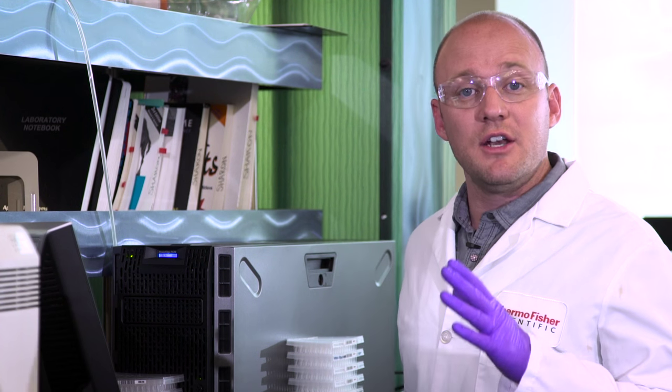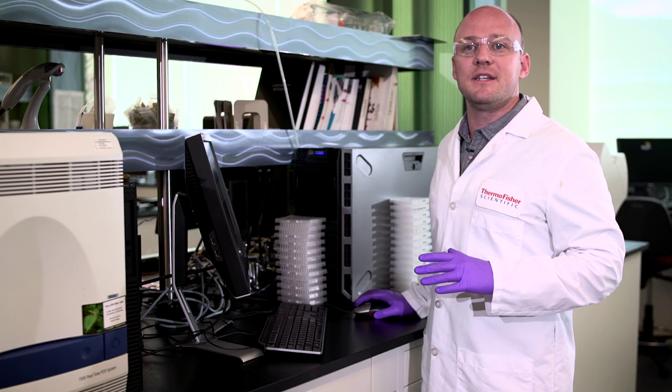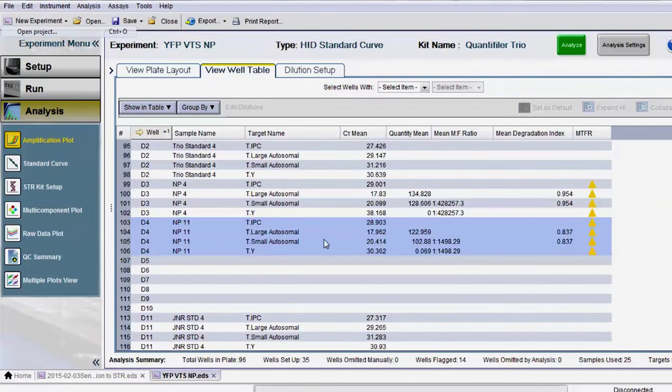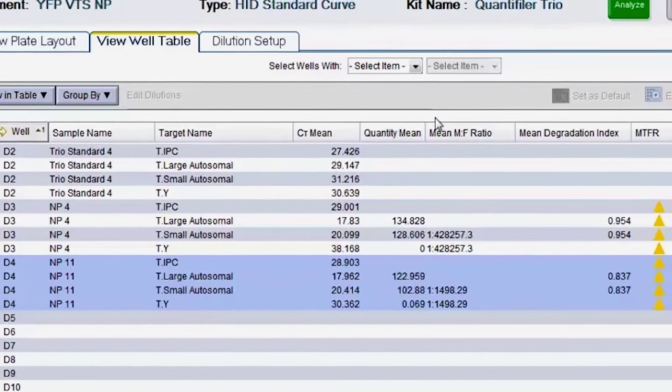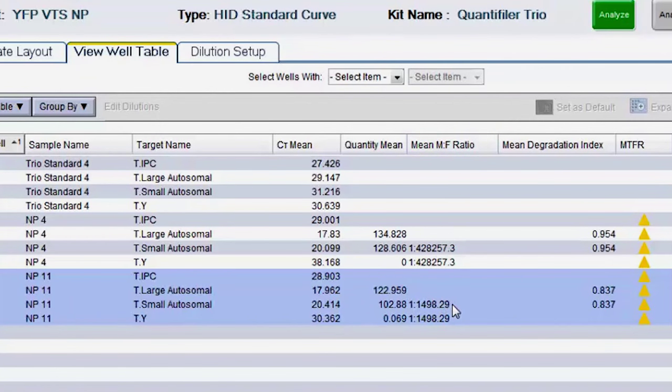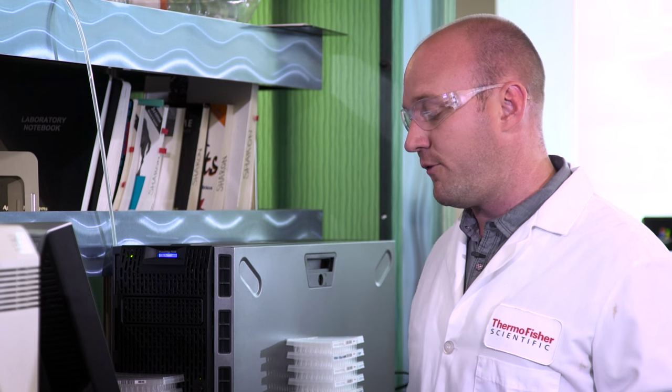Now, let's consider another sample. In this case, we have a vaginal swab that was taken two and a half days post-coital. For this sample, the presence of male DNA was confirmed by the Quantifiler Trio Kit. Our quant result, as you see here, focusing on sample NP-11, shows that we have a male-to-female ratio of 1 to 1498. Whereas your typical workflow might be an autosomal amplification kit, based on these values, we can be confident upfront that an autosomal STR kit would not yield a quality STR profile.